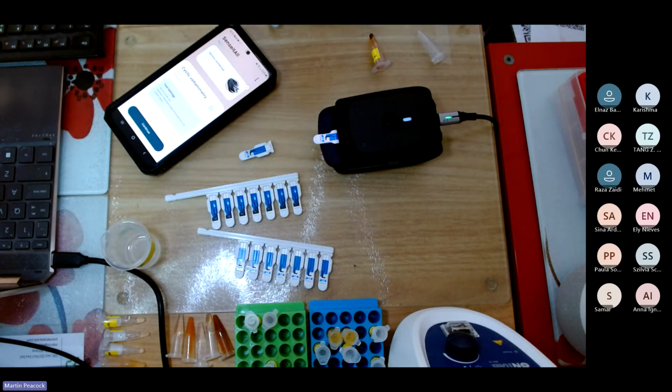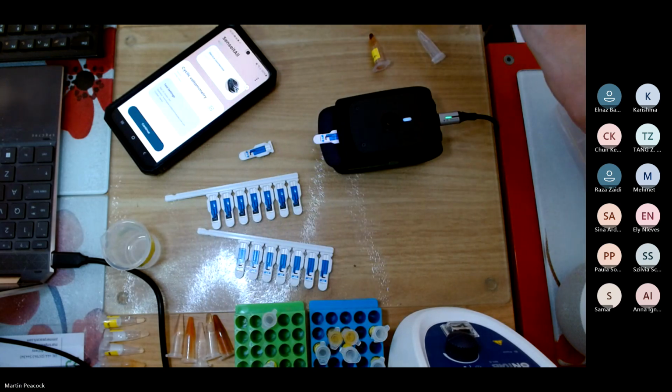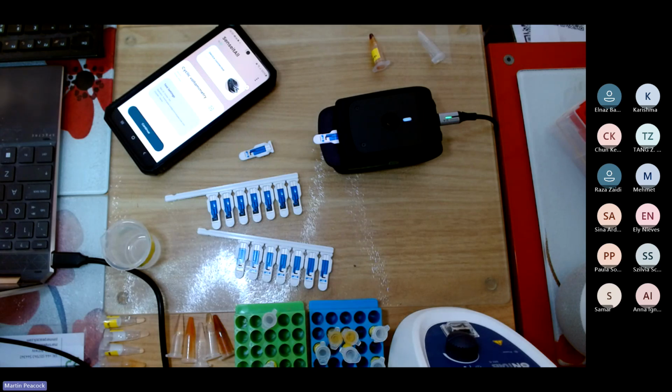That's on, great. Now I'm going to take some ferricyanide. So remember now, this is not a criticism of Zimmer and Peacock, but I realize that when we're manufacturing a new assay on top of a screen printed electrode, we actually often have in our manufacturing process: take electrodes, clean electrodes, functionalize electrodes. I just realized that's actually what we do.